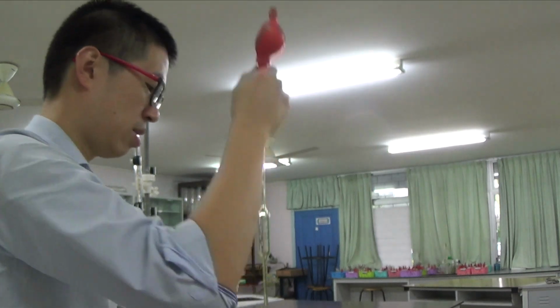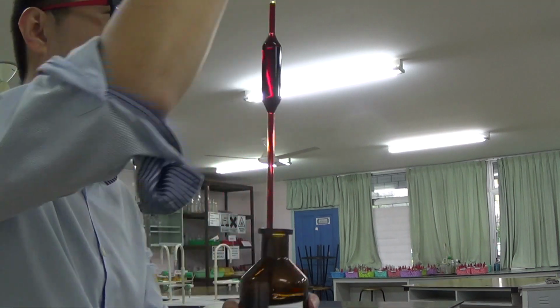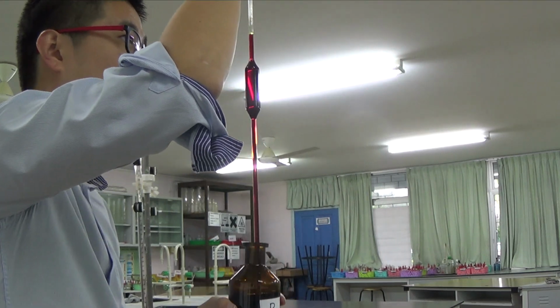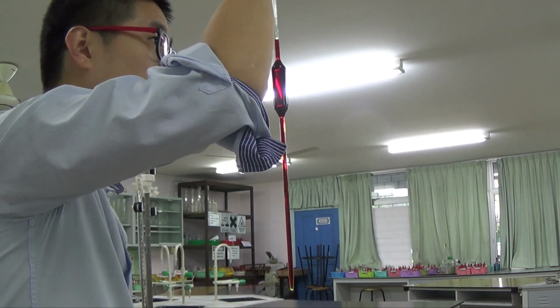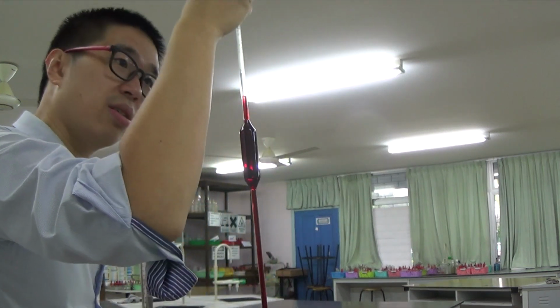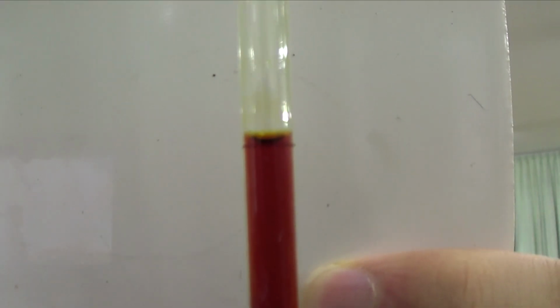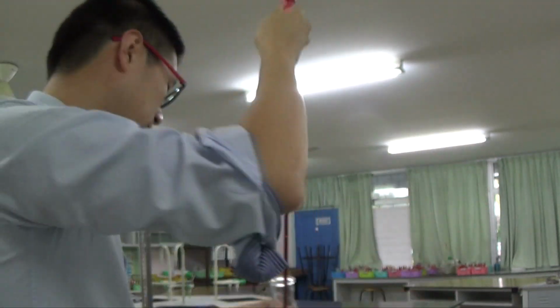So what I'm going to do now is suck out the second portion of my 25 cm cube so that I can do my first rough titration and the second exact titration here. So just very quickly, avoid parallax error, keep your eye at eye level as you're reading it. Okay, I'd better get it focused. Not too sure if that's well focused. So right below the meniscus, there's 25 cm cube there. So put it in the conical flask and start pressing E, eject.